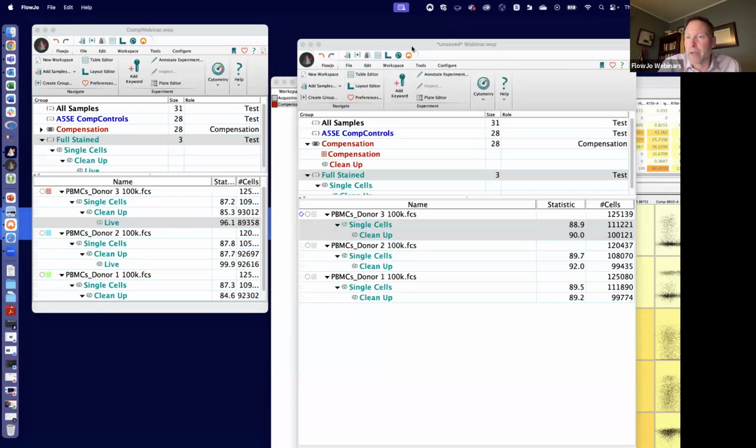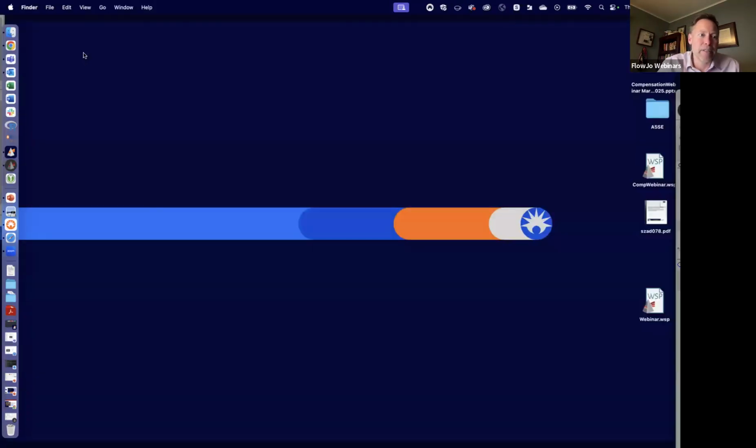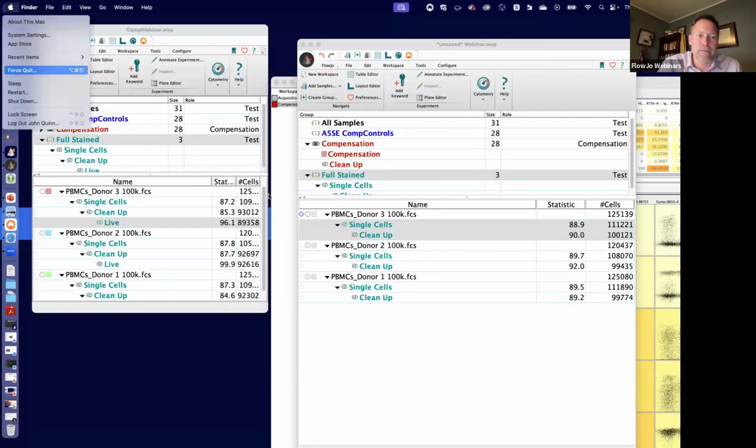Oh, don't take forever right now. We only have 2 minutes left in this webinar. I still want it to break out V11. All right, I am going to force quit.